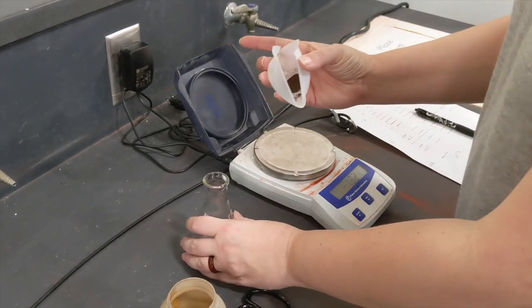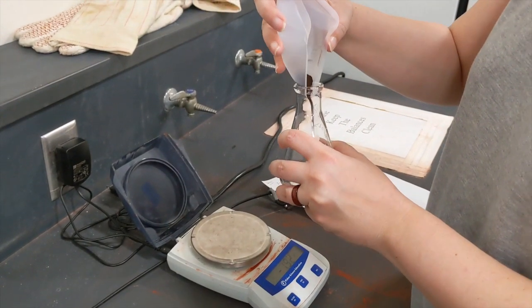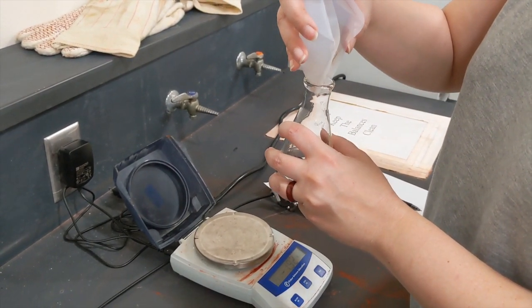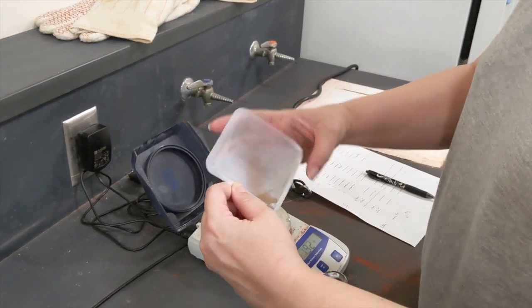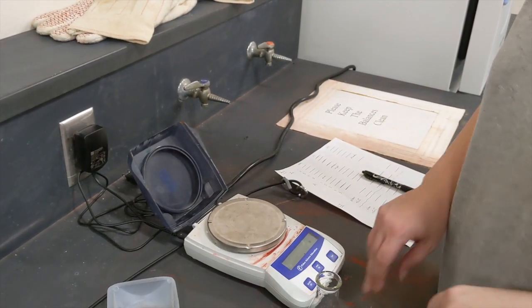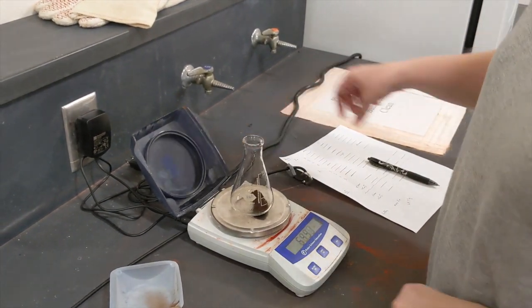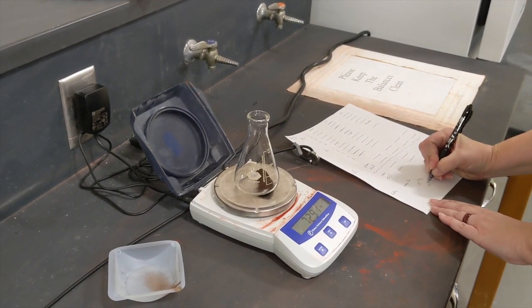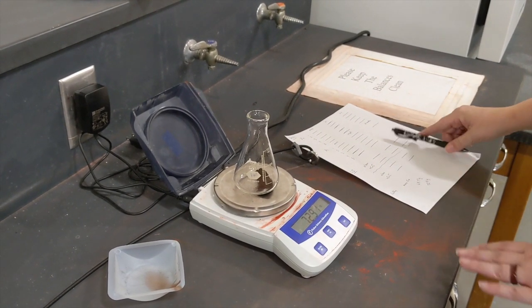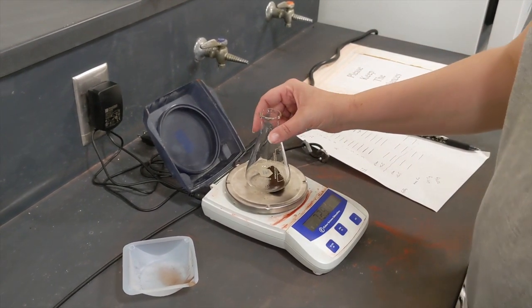So I'll transfer my iron. We can see that there's a little bit left behind, but that's fine. I'm going to re-zero my balance and find the new mass of the Erlenmeyer flask and the iron that's in it. My new mass is 72.91 grams. Without a calculator, I can tell I got pretty close to the three grams I was supposed to have.